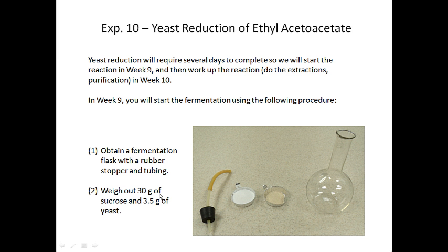So yeast reductions really require several days and weeks, and some of these can be quite elaborate. You have to keep the yeast fed with sugar, and you have to keep them at a very specific temperature. We're not going to do that. We're just going to basically let the fermentation reaction occur, and in the past this has been fairly high yield. We don't see much unreacted ethyl acetoacetate at all.